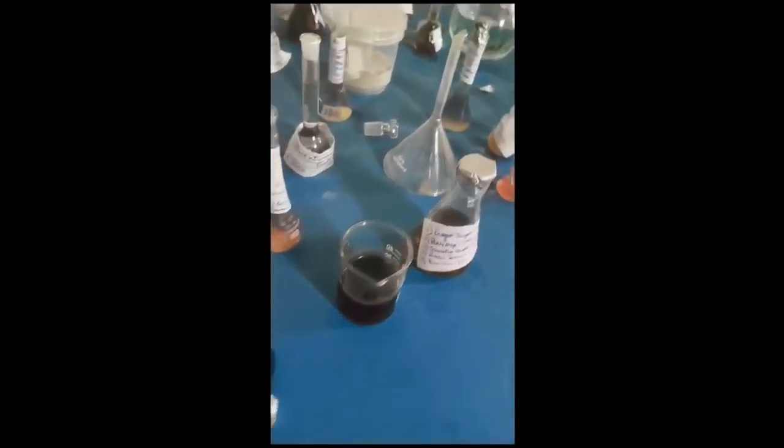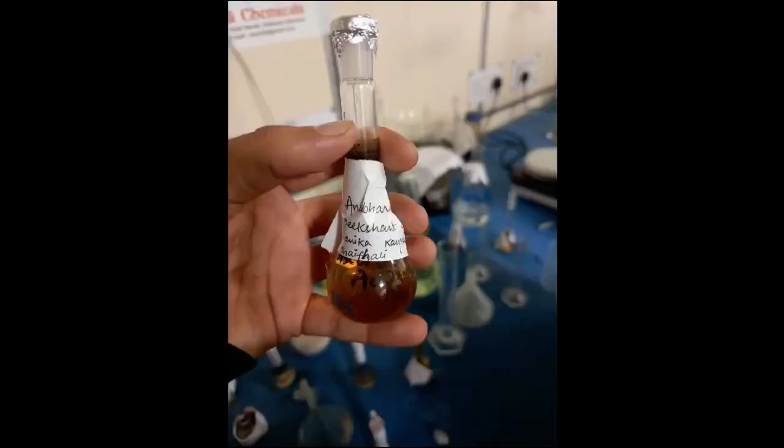The RPM will be 540 and we will be doing this procedure for around 30 minutes, as my teammate said. After this we will pass a laser beam and we will get to know whether nanoparticles are formed or not. Thank you.